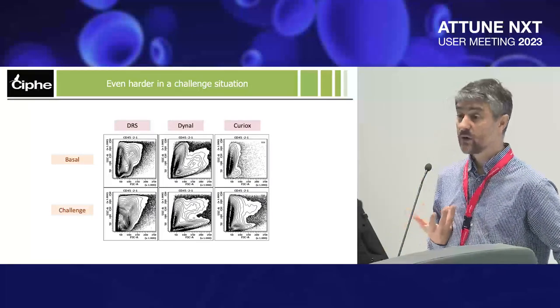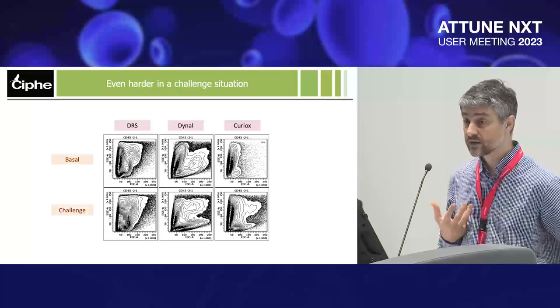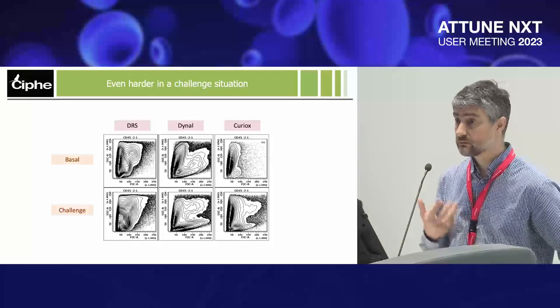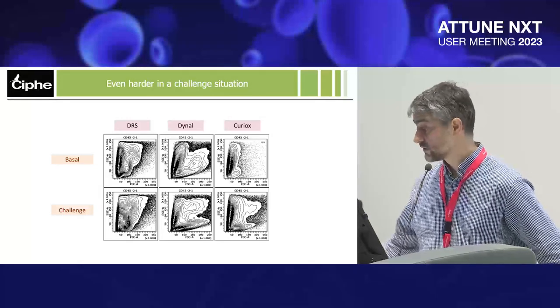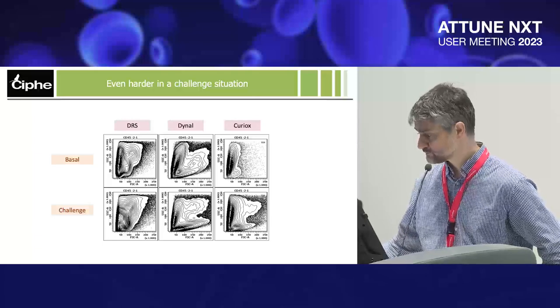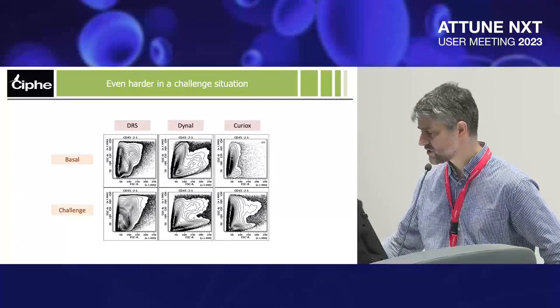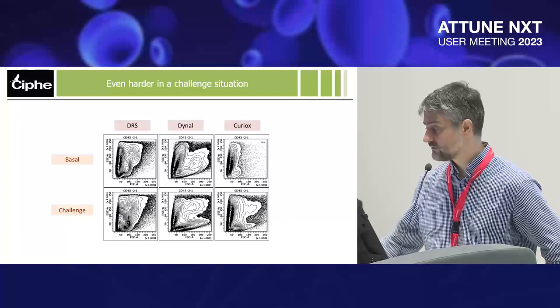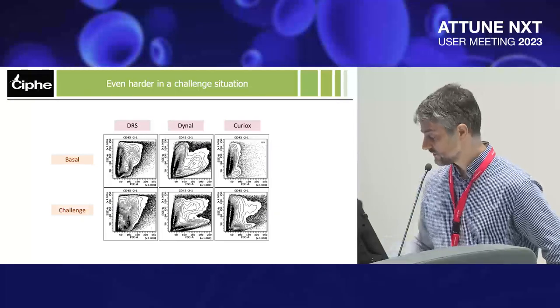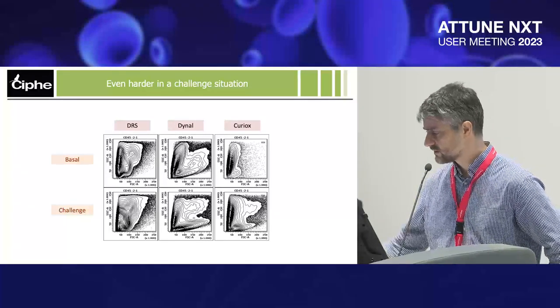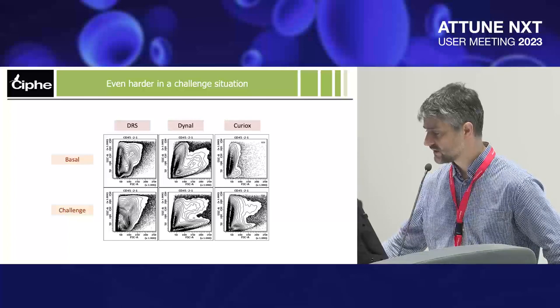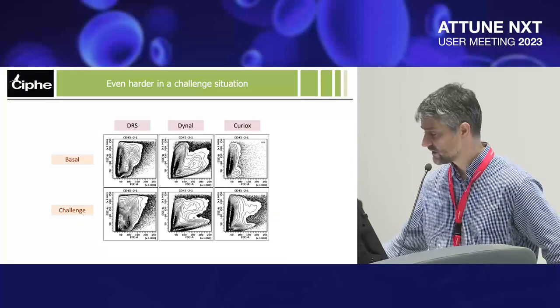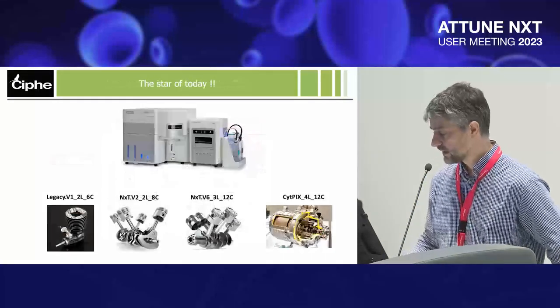We don't want to study the pancreas at basal state — we want to look at it in a challenge environment, which is even more of a mess. Because we don't know the sample in front of us — it's terra incognita — we really need to understand what we're doing to find the right cells. We tested several approaches to remove debris, but were never able to get rid of a particular cluster of particles. And actually, our cells of interest were residing right there.